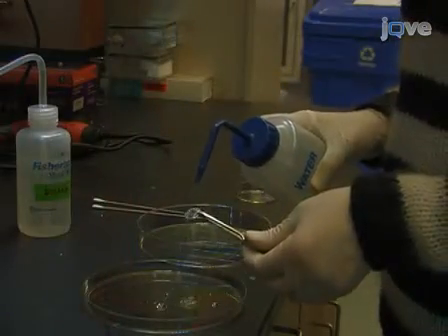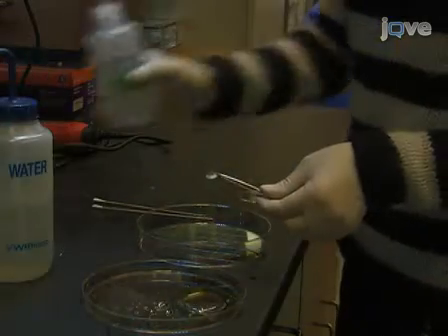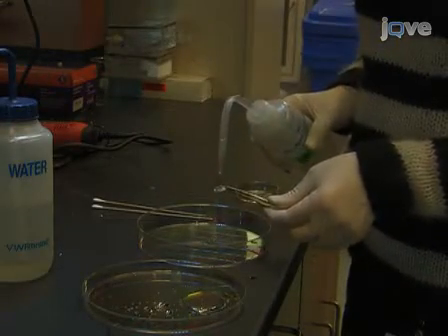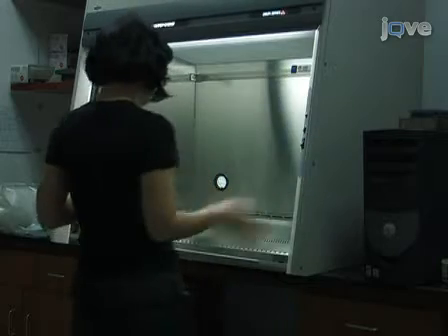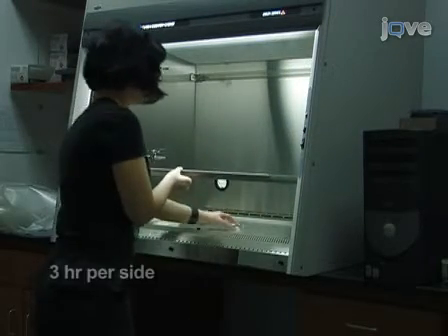Wash the MIW with deionized water, and then again with 70% ethanol. Use a Q-tip to clean the glass until it is completely transparent. Use acetone to remove any remaining foggy spots from the glue vapor. Finally, sterilize the MIW by exposing it to ultraviolet light for 3 hours on each side.